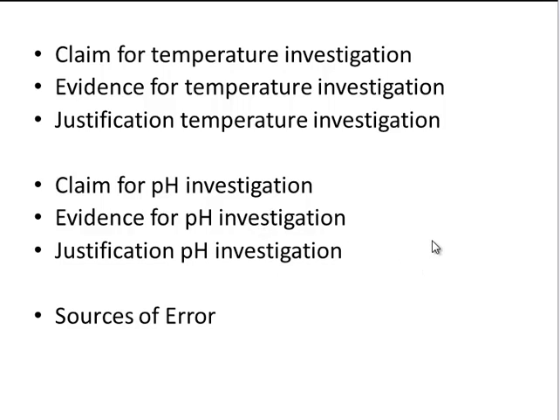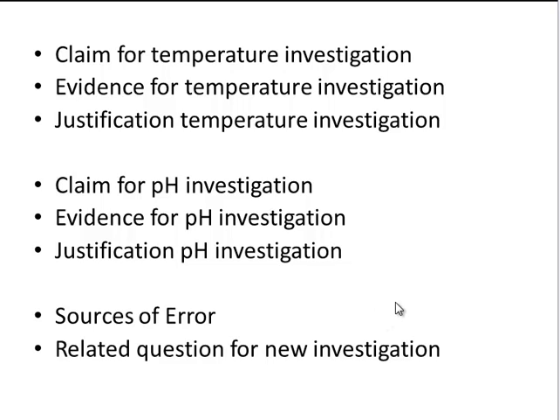Finally, evaluate your protocol. Were there any sources of error? Did you use too many drops? Were you sloppy about the time? And what's a new question you'd like to investigate that relates to enzyme activity? And now you are all set to conduct our lab on enzymes.